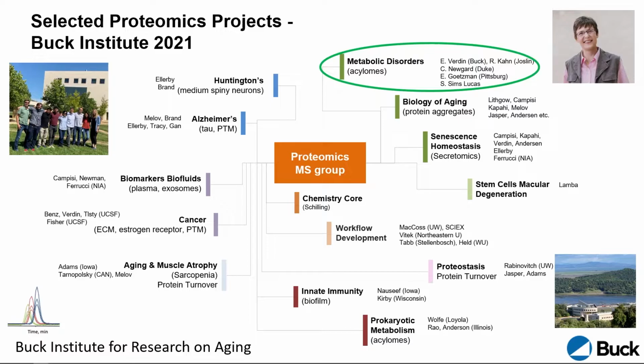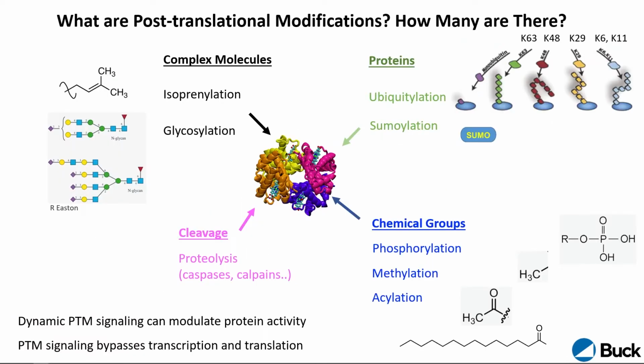So, thank you, Mario, for talking a bit about the phosphorylation. That's really a key chemical modification. In general, the PTM space is huge, right? So, I mean, there are really many PTMs, very complex, ubiquitination, even proteolysis. I like to present to you a little bit today about acylation. This is really important in signaling and many diseases. So let me show you a little bit about that.